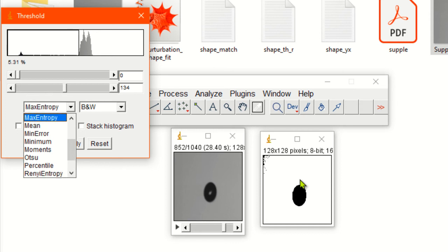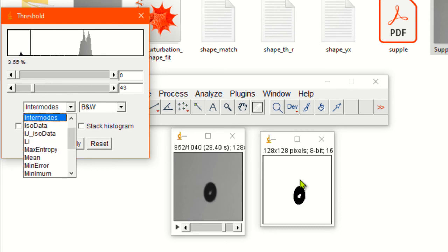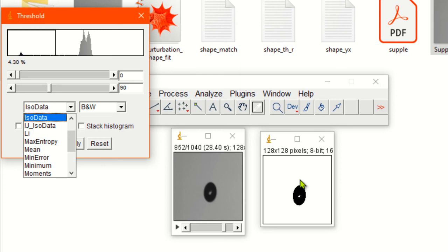It will reduce the boundary, so probably we will not go through it. Let's go to max entropy. Oh my god, it has a high level of noise. All right, so I'm randomly choosing isodata. You can choose any method depending on your situation.